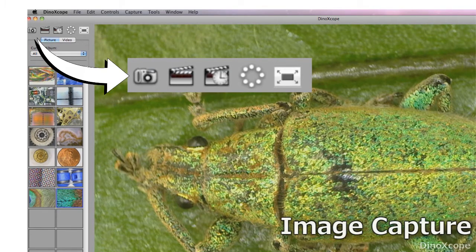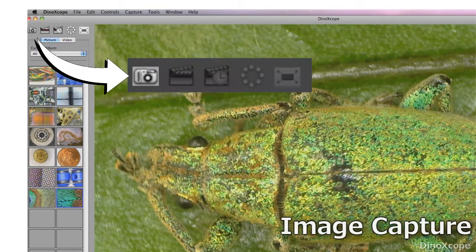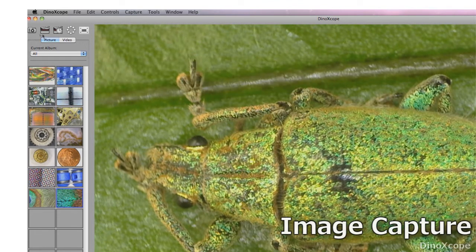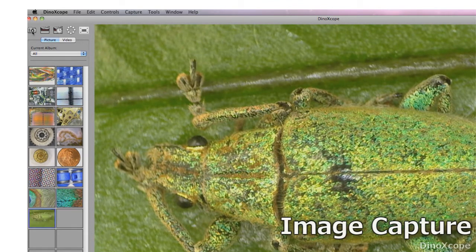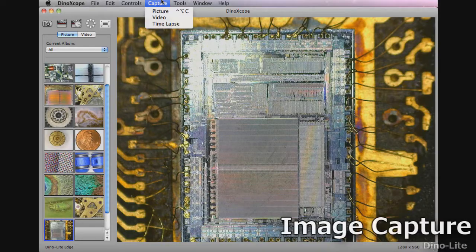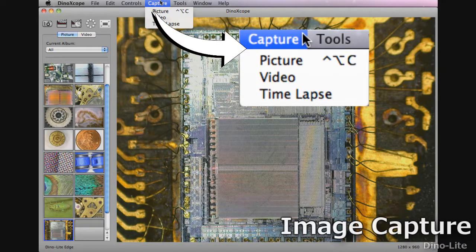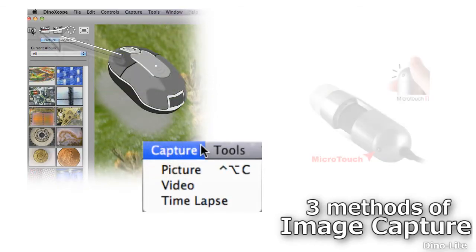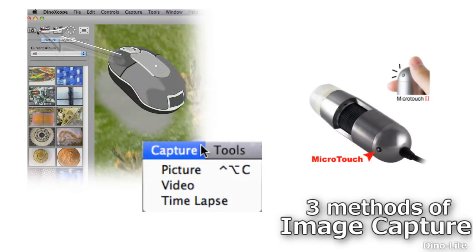To capture an image click on the camera icon. Another option is to select picture in the capture menu. A third way to capture images is using the micro touch trigger found on most DynoLite models.